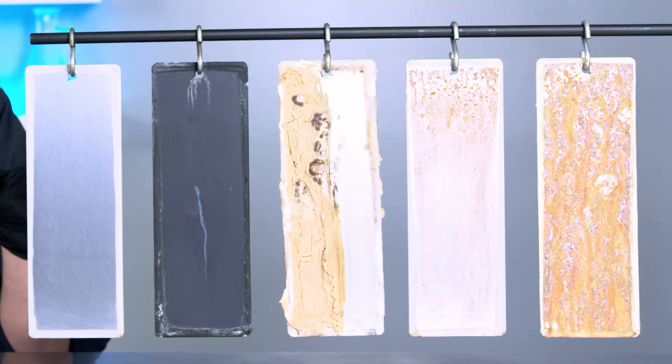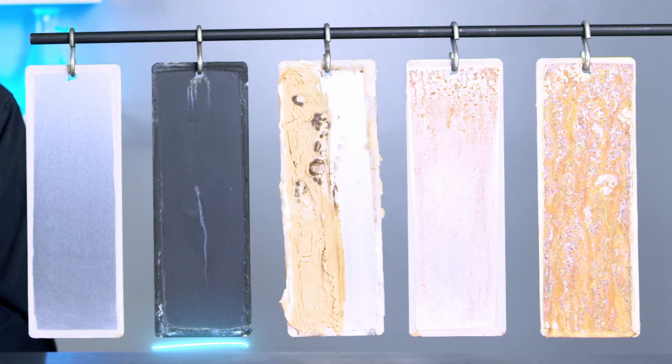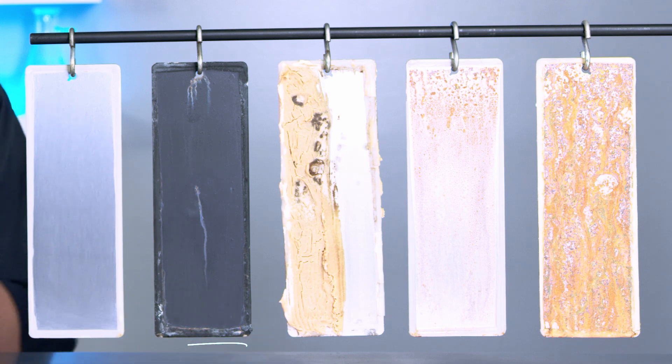If we take a look at this fourth panel, this is where we applied a rust paint. If we were to remove that rust paint from the surface of the metal, you would see underneath that it has completely protected the surface of that metal from preventing any sort of corrosion.